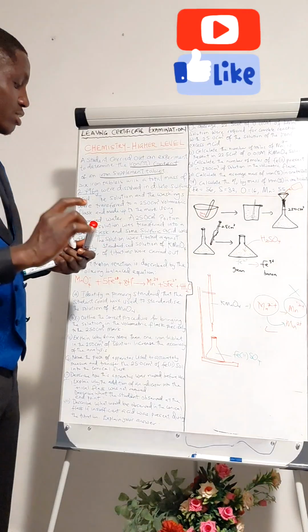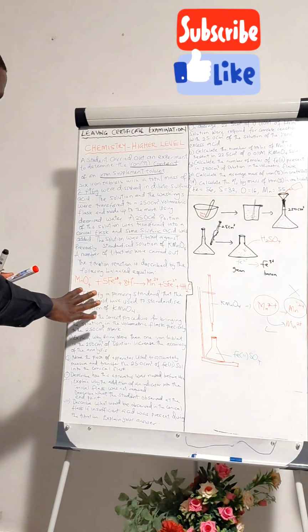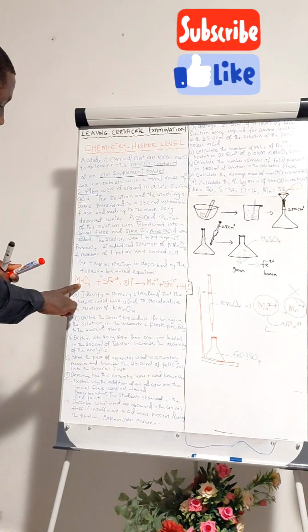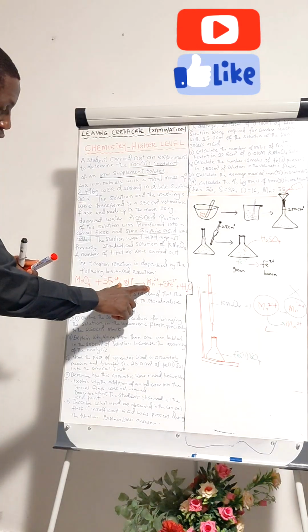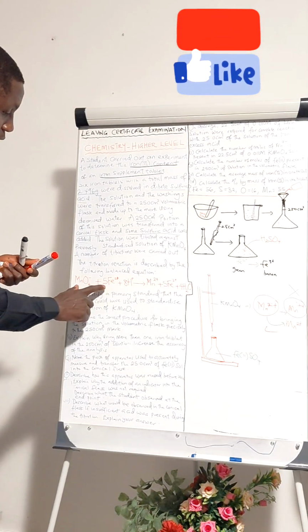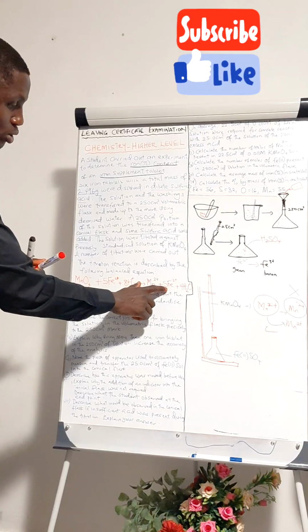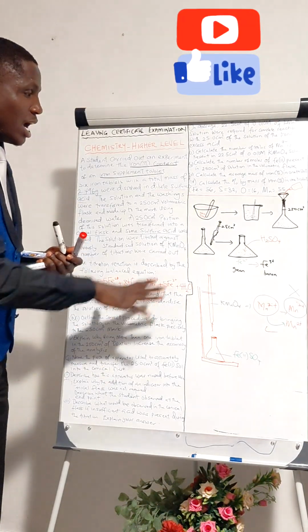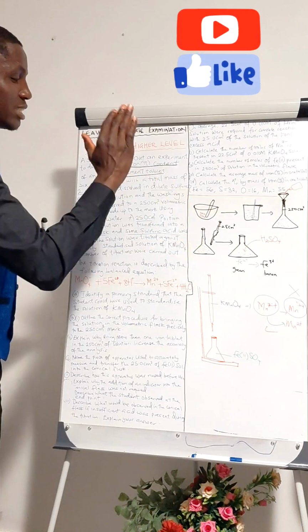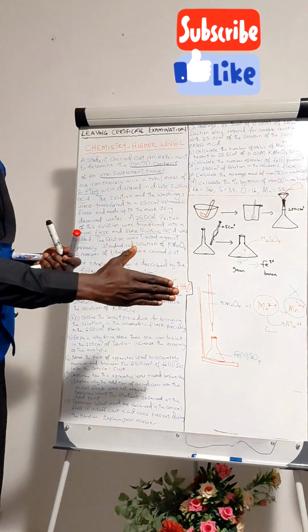So these are the things that you need to understand about the reaction. And here is the equation for the reaction. We can see manganese 7 here has changed to manganese 2 plus, and iron 2 here has changed to iron 3 plus, which is what we want to happen at the end of the reaction. And these are the processes involved in the practicality of the reaction.